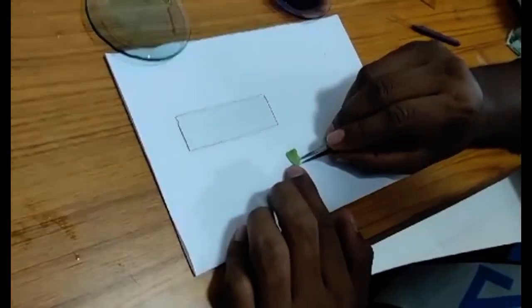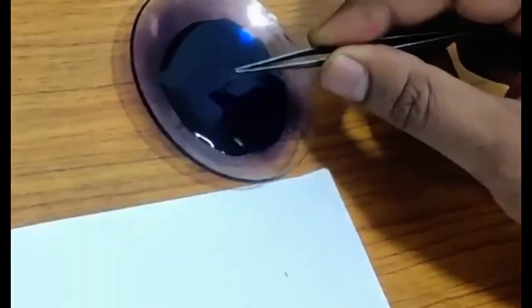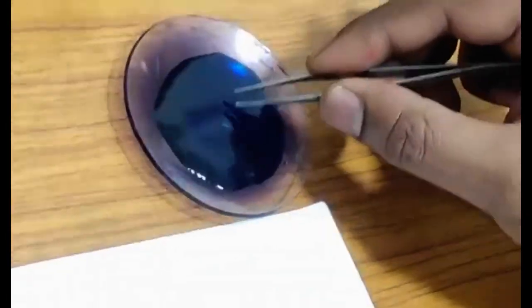As we know, some hair-like structures are present on the surface of the leaf or plant, even the entire body of the plant. These are called trichomes. So I'll show you today how we can observe these hair-like structures under the microscope and how beautiful these structures are.